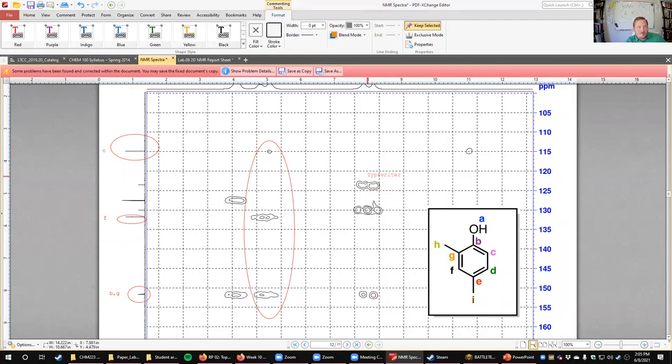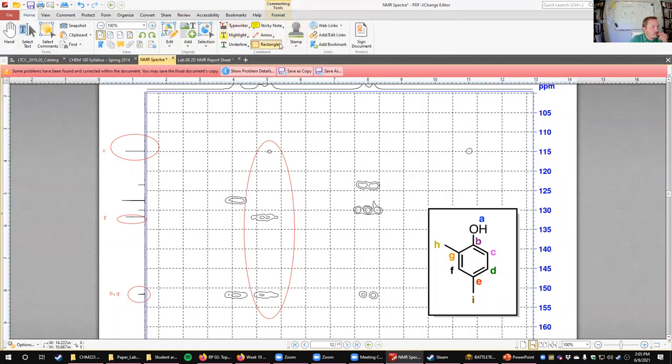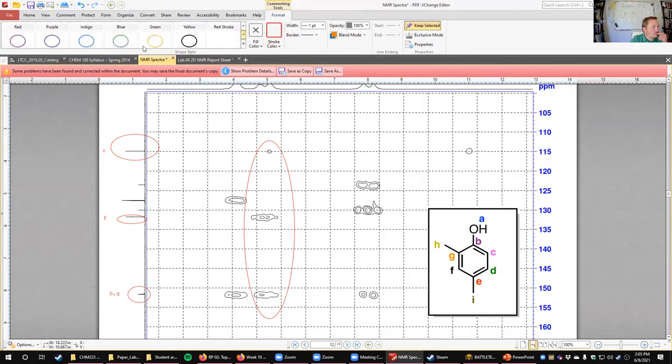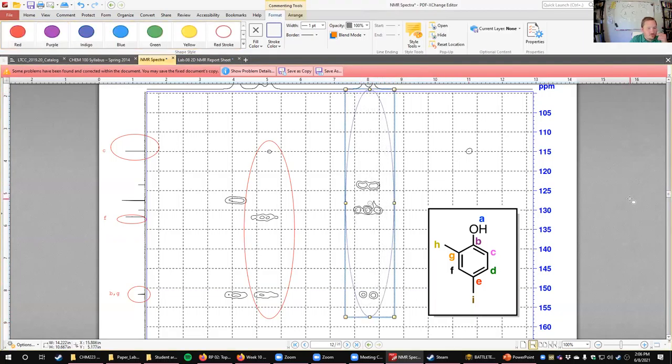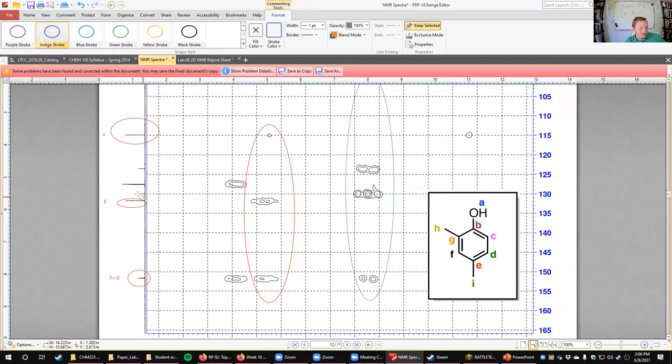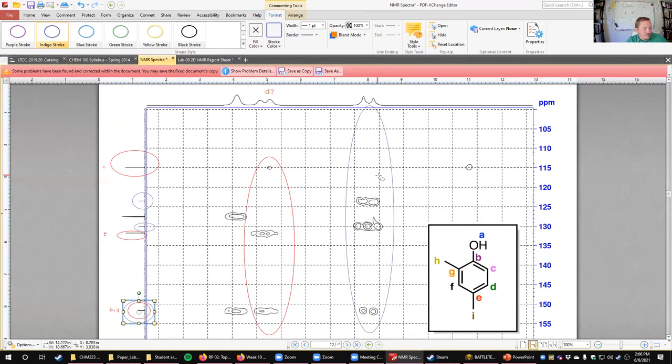Right, and then that's going to allow us to look at this other proton that's associated at 6.67. Also has three signals. Some of them are the same, but one of them is different. Actually, two of them are different. So for this group of signals, we have something different, right? So we think that this one is D because that's the only way F should show up. Here we've got a signal here, and then the same one here, which is B or G. So because we have B or G, we still can't be totally certain on that one.